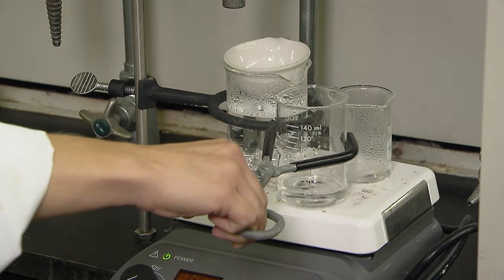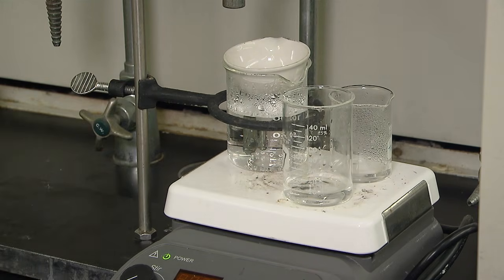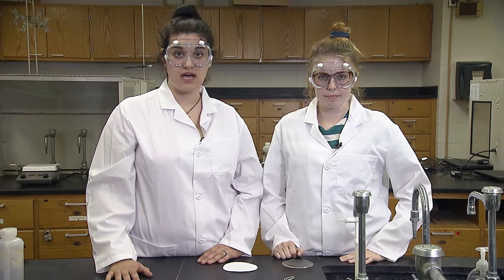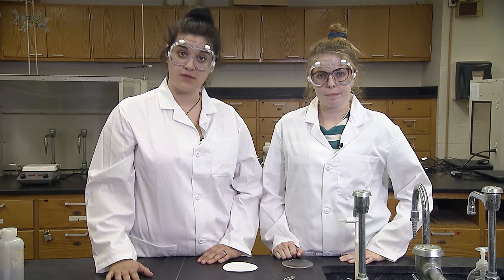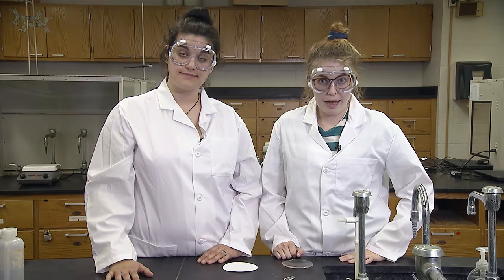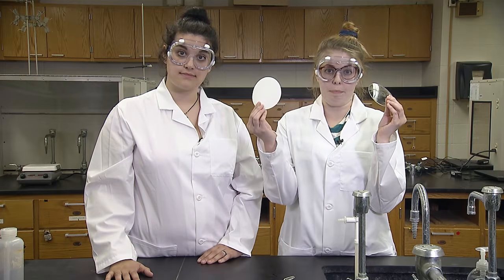Part 4 will require beaker 1 to be placed on the hot plate. This could mean that you have 3 beakers on the hot plate at once. They should all fit, but you will have to be careful while adding or removing glassware. A reaction is then carried out in beaker 1 to regenerate the calcium carbonate solid, and gravity filtration is again used to separate the solid from liquid. You will want the mass of the calcium carbonate, so you should take the clean, dry mass of a new watch glass and a new filter paper.